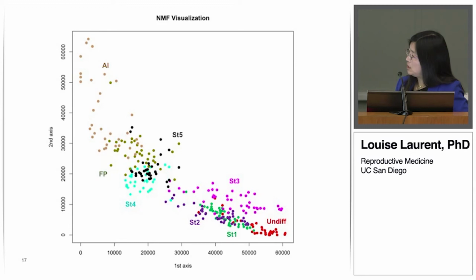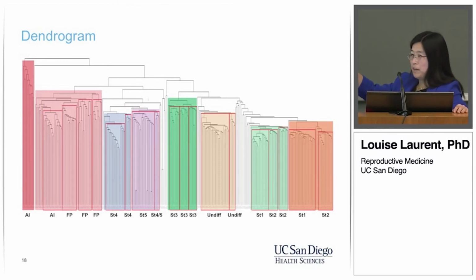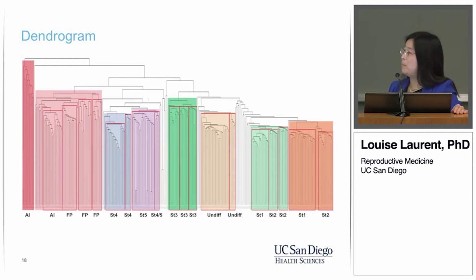Just another visualization. This gets kind of ugly with lots and lots of samples. But one thing to point out is that after cleaning the data and getting rid of the cells that do not have sufficient numbers of reads, you end up with, so this is an unsupervised clustering, some interesting insights into the experiment. So what we did is, again, this is unsupervised using all of the data. The only thing we did to filter the transcripts was to demand that the transcripts in this data set have at least, sorry, not 5, 10 uniquely mapped reads in at least one cell.